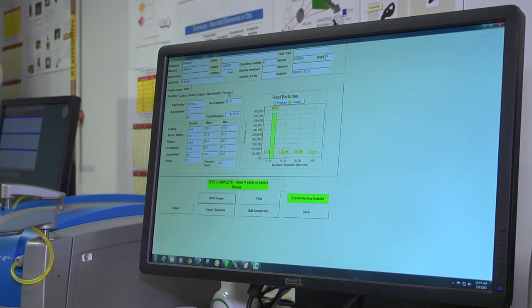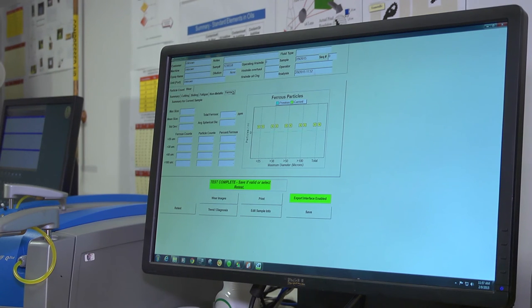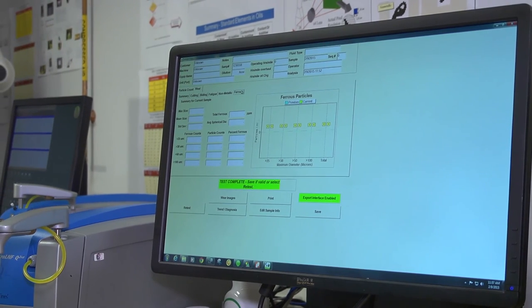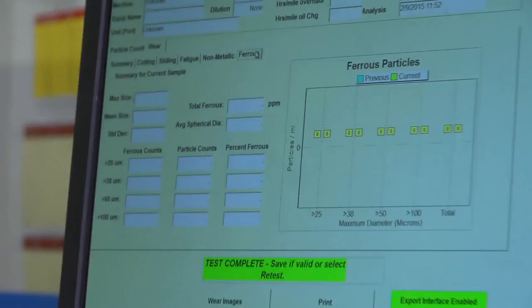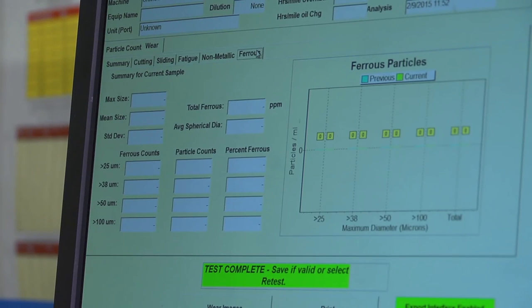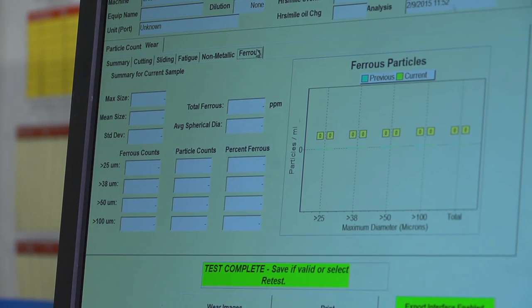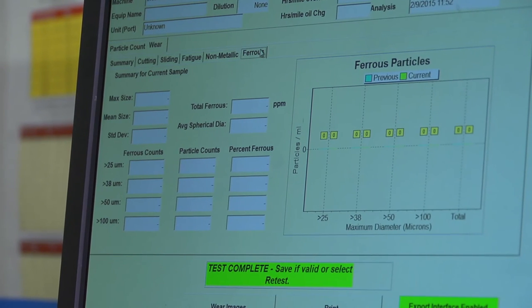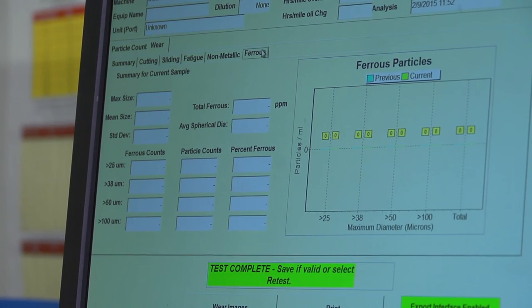Additionally, if we look at the ferrous tab, you can see that this had no large ferrous, and so there's no ferrous in this particular sample. Now, we can run another sample with the ferrous validation standard, and we'll do that just now just to make sure that, in fact, this particular sample we ran had no ferrous.